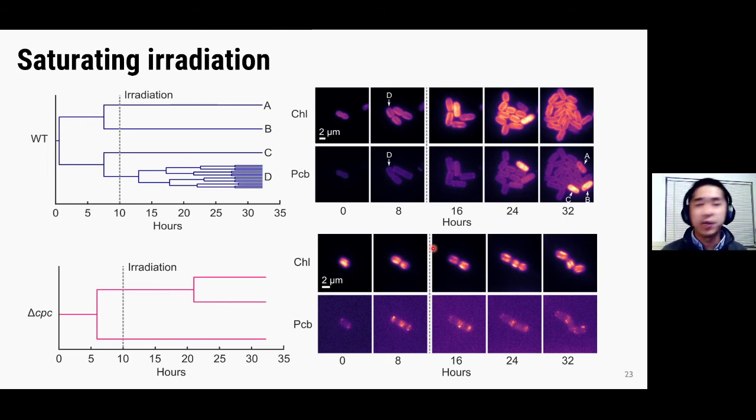So here are the lineage plots for representative colonies in that movie. So for the wild-type cells, you can see that was the colony that I showed you earlier. So basically after irradiation, three of the sisters, A, B, and C, stop growing, and they glow bright in the phycobilisome channel at the end of the movie. But this sister here, D, seems to be fine. It doesn't seem to be affected at all, and just continues to divide. And the same thing here occurs for the delta CPC cells as well. We see examples of this asymmetric survival, where one sister is fine and continues to grow, and one sister seems to have stopped growing.